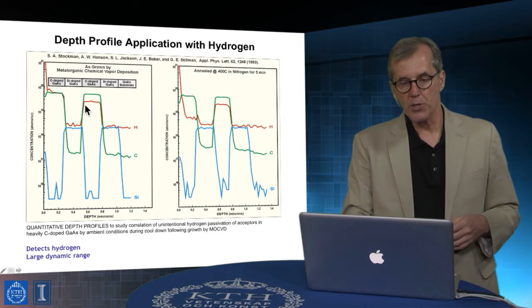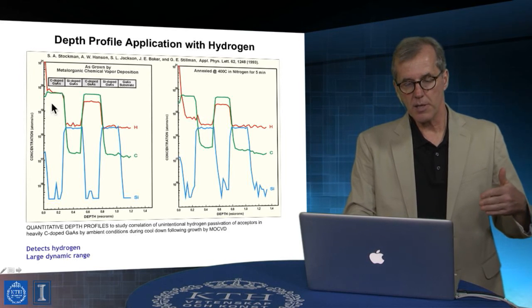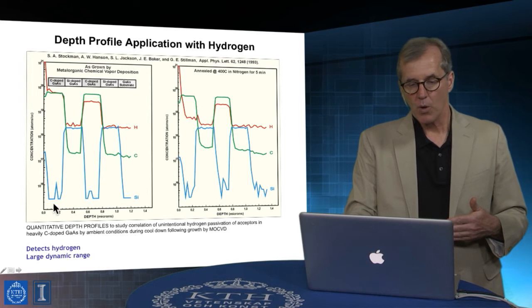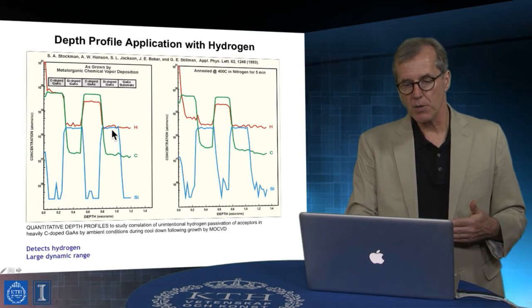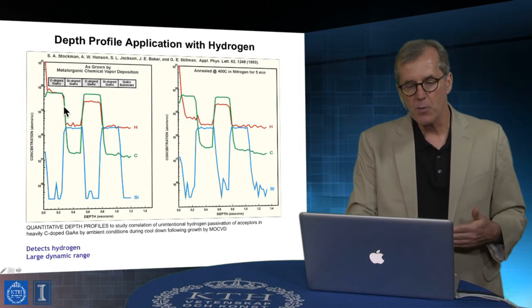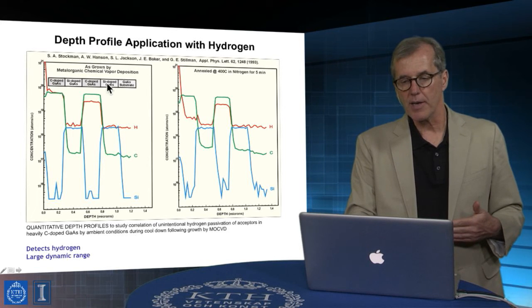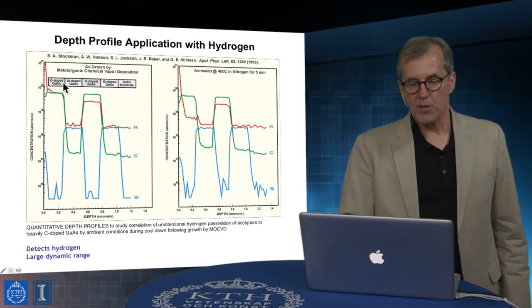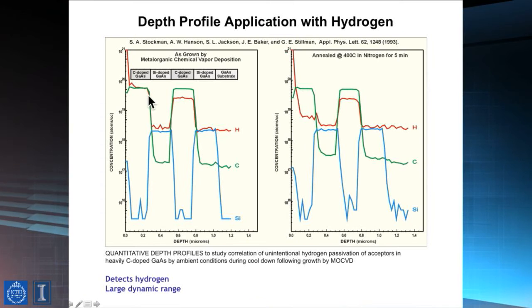And actually, what's shown here is a sputter depth profile in which all the components of this are measured, but one really funny one, which isn't actually specified in the layer that's shown there, and that is via the growth sequence, whether or not there's been the incorporation of hydrogen within the semiconductor levels.